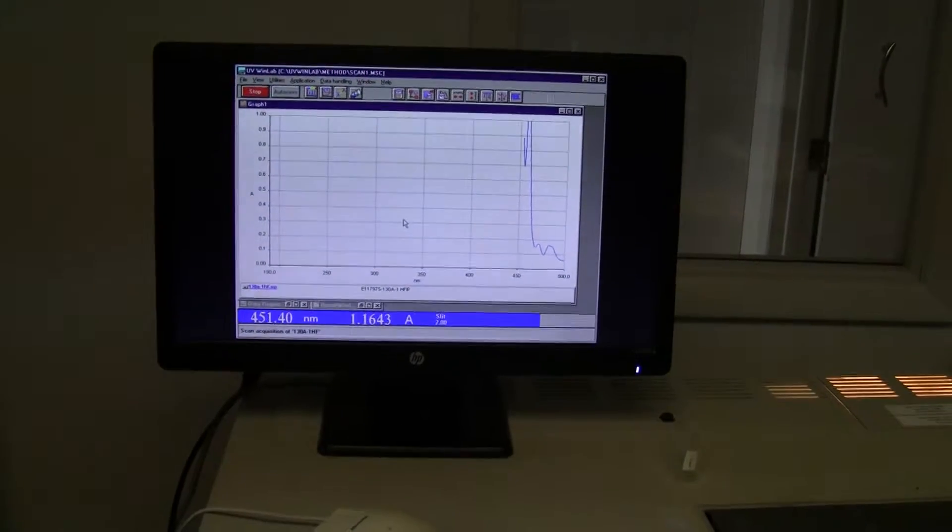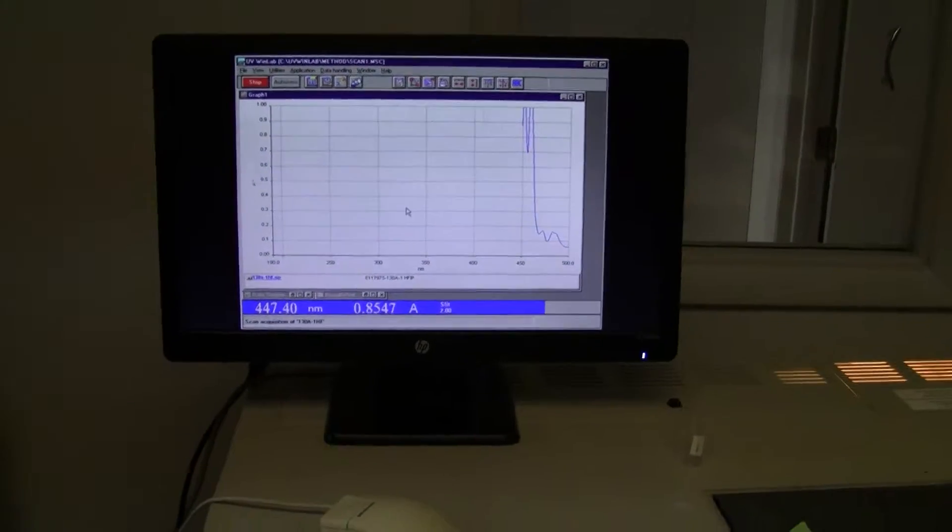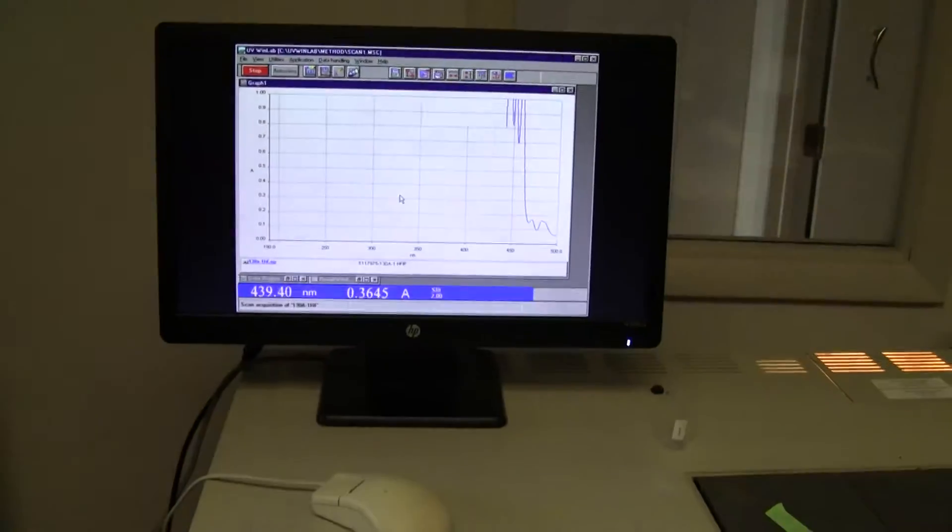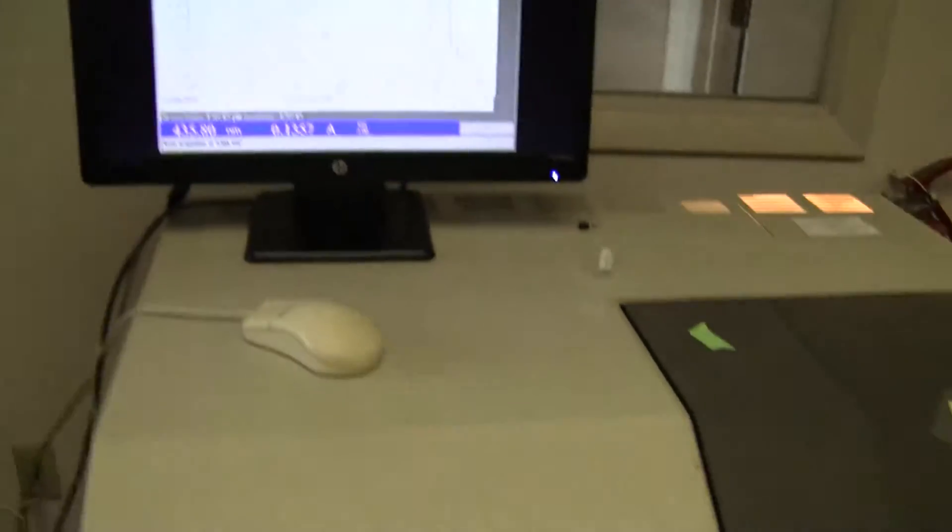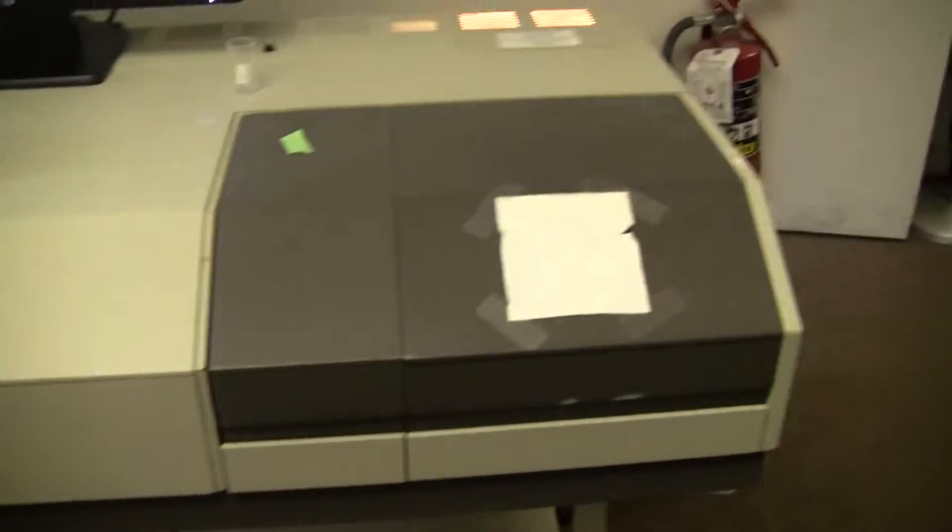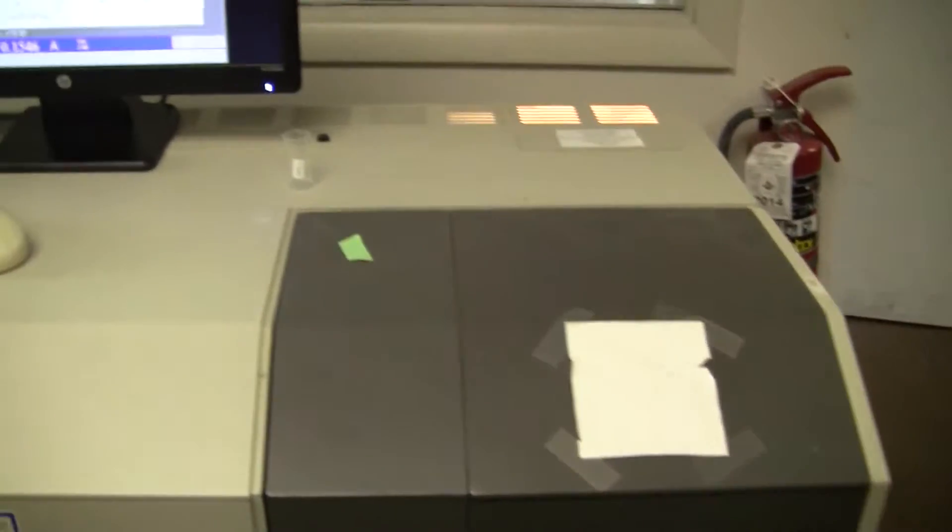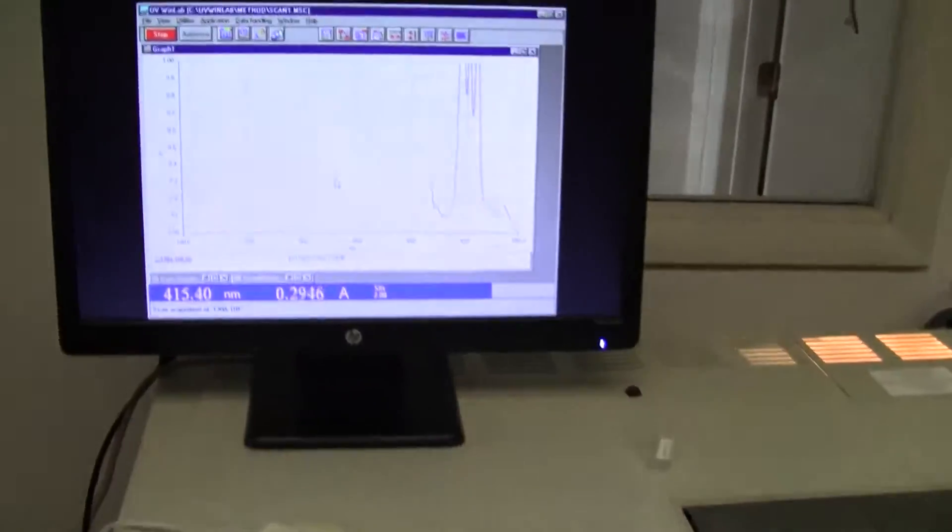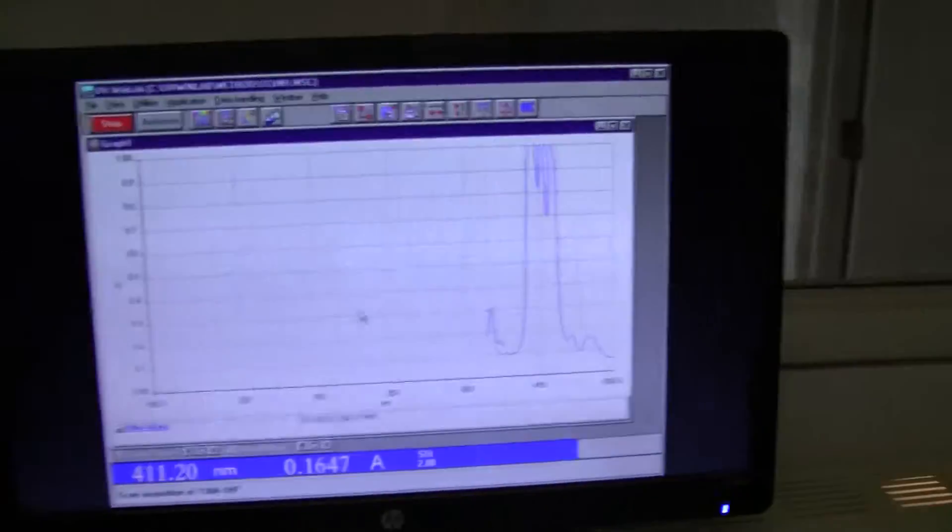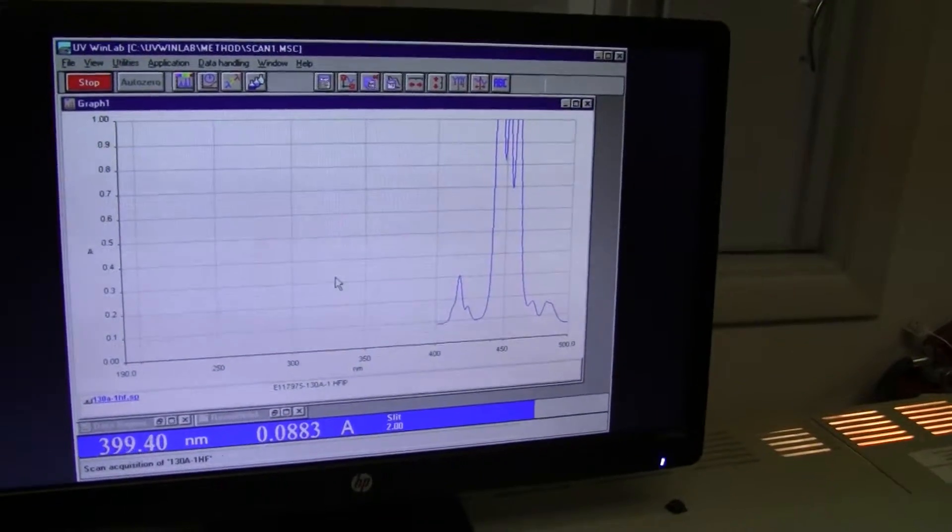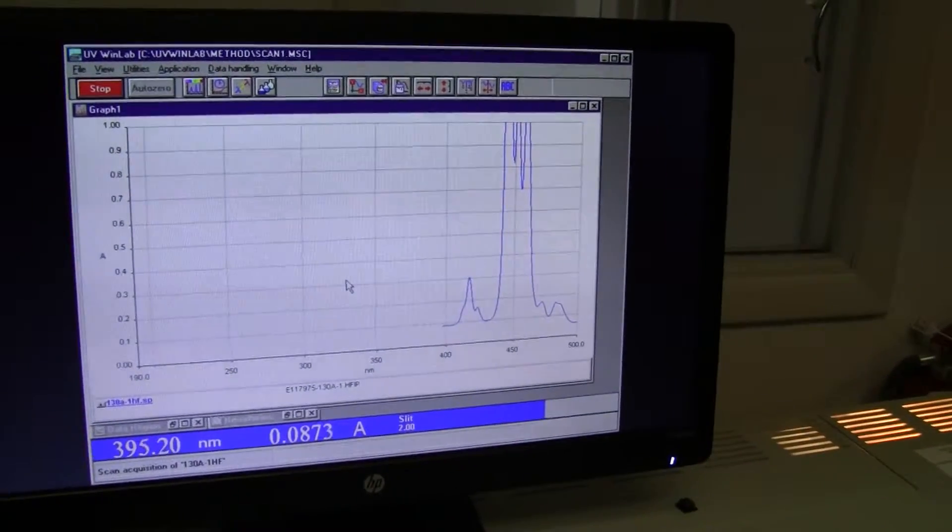We're running a range of 190 to 500 nanometers. We're using a Windows 95/98 operating system.